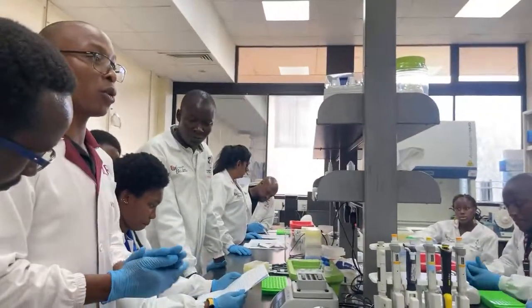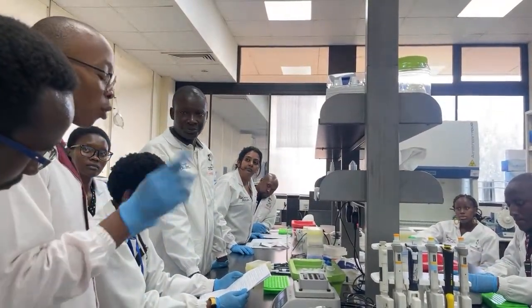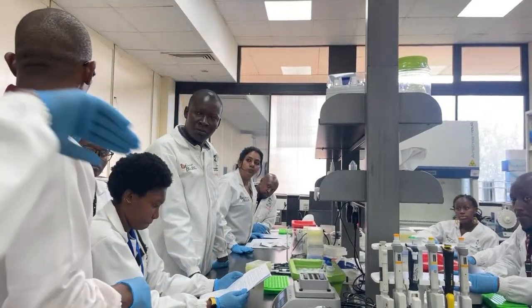And so we're not going to do the... I actually forgot about the overnight step. So these ones will run tomorrow.